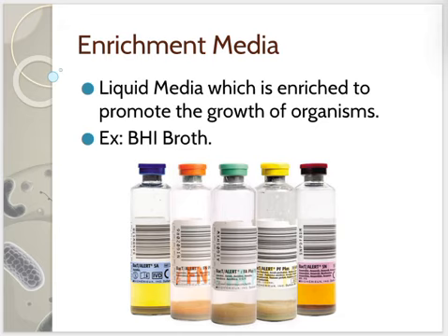Enrichment media are usually liquid and designed to promote the growth of certain organisms by providing enhanced nutrients. An example is BHI broth, which is enriched to support a broad range of bacterial growth. These media help increase the number of target organisms in a sample, making it easier to detect and study them. This selective promotion is very useful in microbiological investigations.